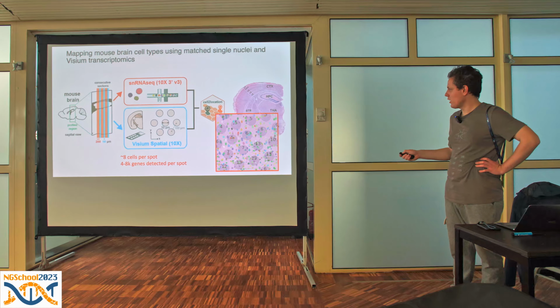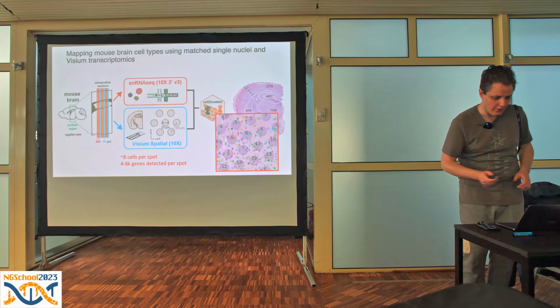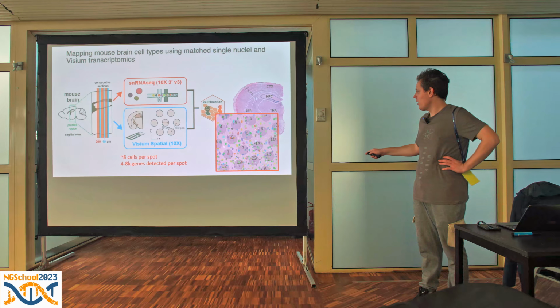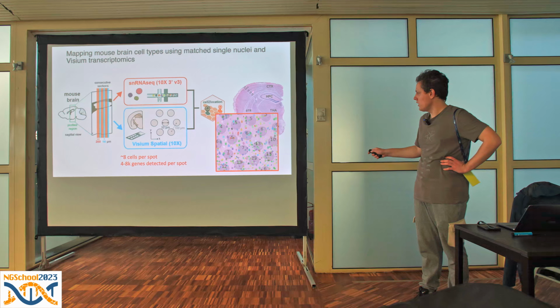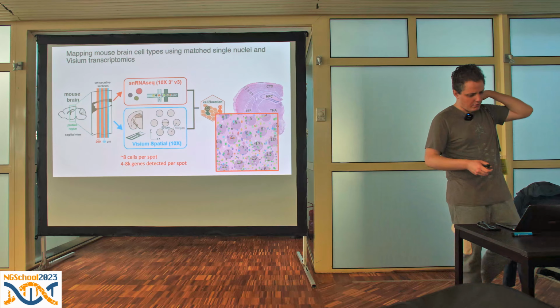And this section includes a lot of brain areas. One of the points that we also looked at in this analysis is, if we overlay expected locations of these Visium spots as well as their size on top of the tissue, how many nuclei do we observe in each of these spots? You can see two things here. One is that the number of nuclei varies quite a bit, even within the cortical area. But also that you have partial cells. You have partial overlap of some of the nuclei with these capture areas.